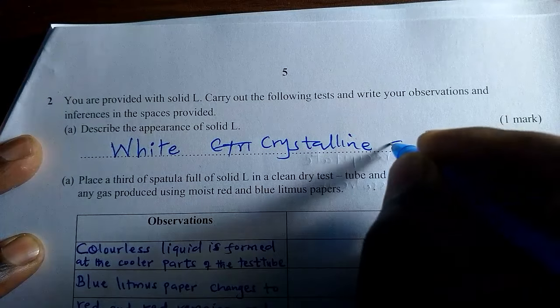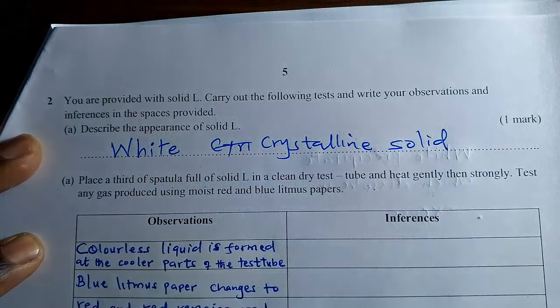White crystalline solid. It is a white crystalline solid. A white crystalline solid, as you can see.